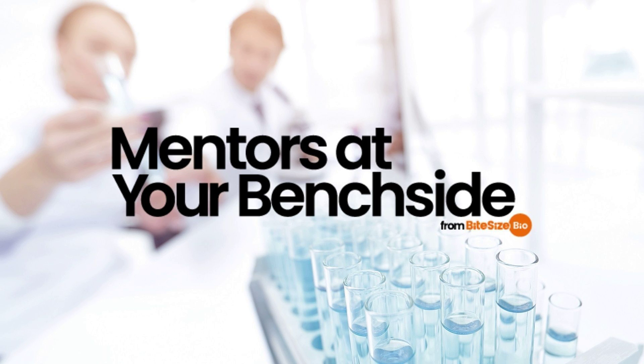Vitrifying biological samples increases the resolution to which data can be collected through the following 3 ways: reducing the radiation damage caused by incident electrons, protecting samples from the harsh vacuum inside the microscope, and locking water molecules in place around native samples. Remember that water molecules are part of the sample's quaternary structure.